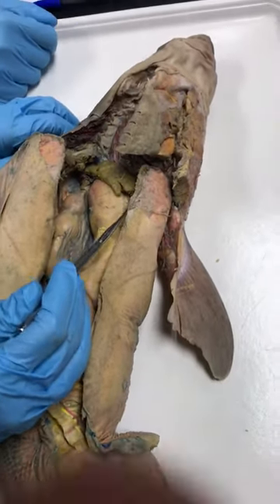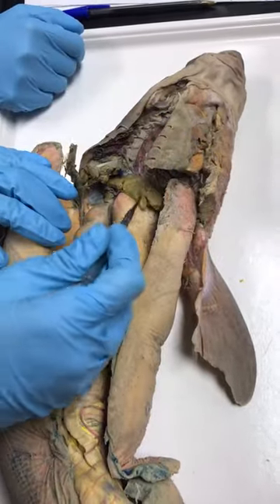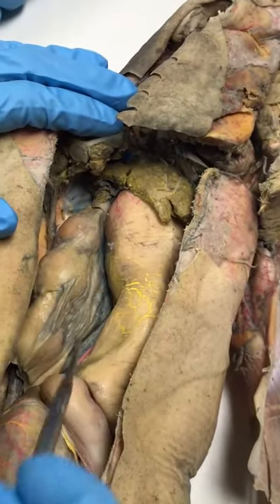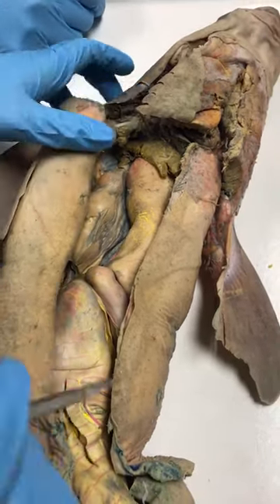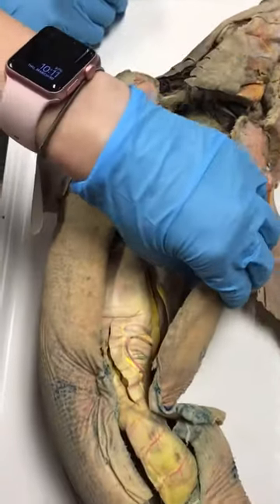The dogfish shark liver has been cut out because it gets really flaky. Here's the top part of the liver — you can see where it's been cut. The liver is going to be really big in a shark and will have multiple lobes. You can cross off the gallbladder because it's pretty much cut out with the liver.